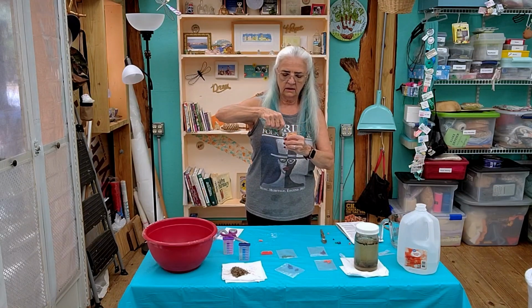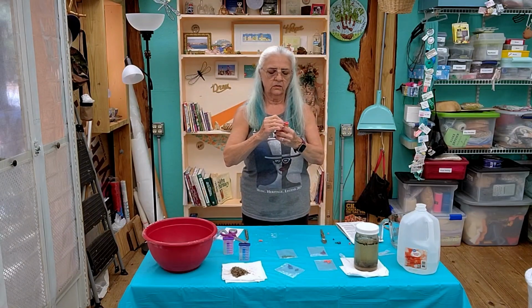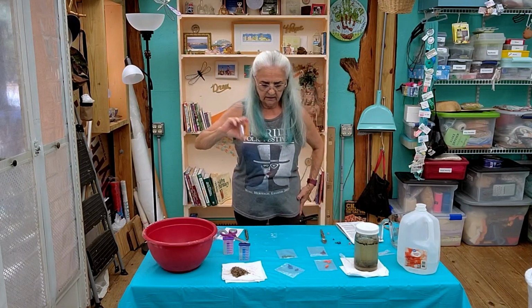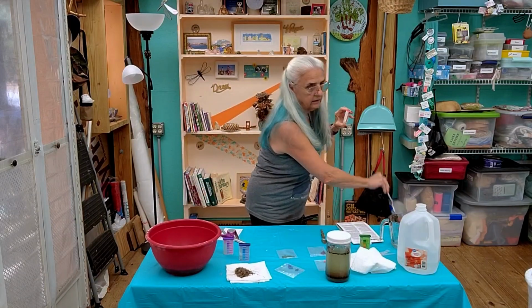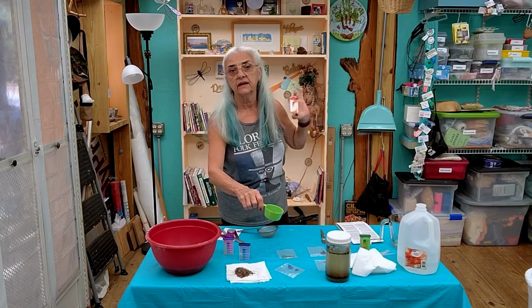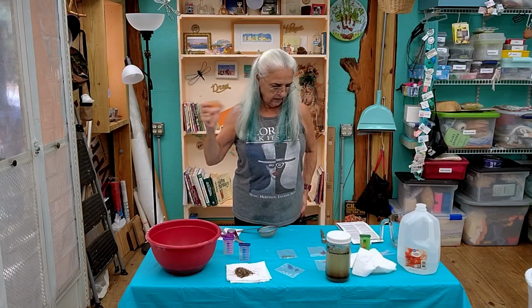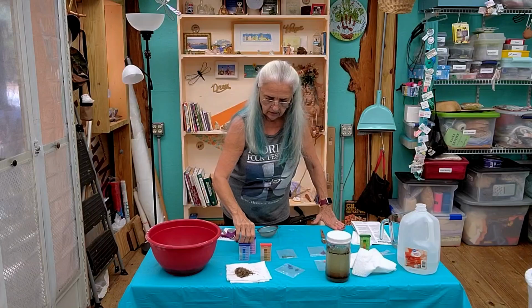And then I can definitely tell you that when the capsules got hot, that was a real mess while I'm shaking this. This soil had so much debris that I actually filtered the sand into my cup here so that I would not take up the space with pieces of things. And that's what I put in here. So shake it real good, and then we're going to let it go for 10 minutes.